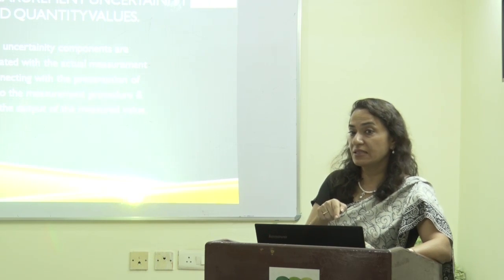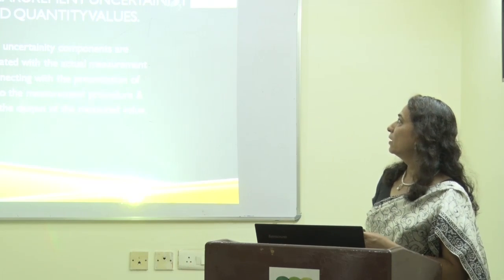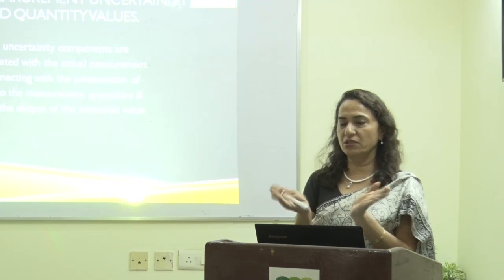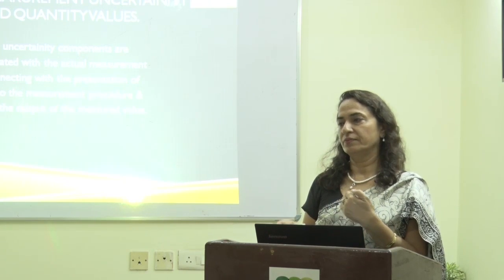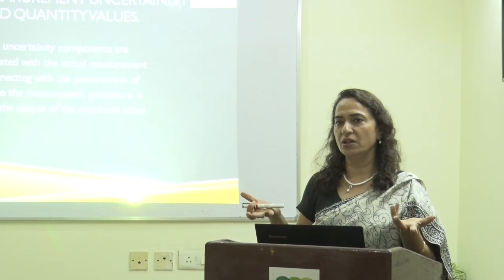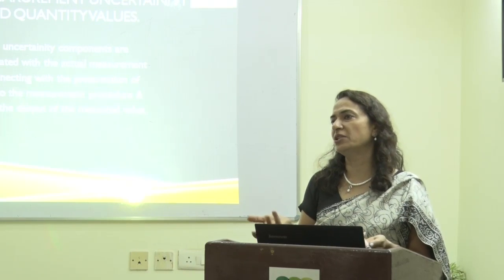And we discussed this when we talked about measurement uncertainty, and now also the matter is the same. This CV percentage is because of what? This variation is because of what? Temperature or humidity, room temperature. So those things which are not measurable, which are uncertain, we can't measure, so we include that this much we are allowed, because we can't measure them.